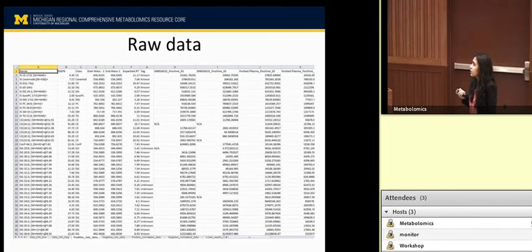But we see about 10 to 15%. So we usually give a tag of unknown to the odd chain fatty acid lipids, and this can be a false identification. So just to give an idea to keep in mind. And of course, the raw peak areas for each of the values.